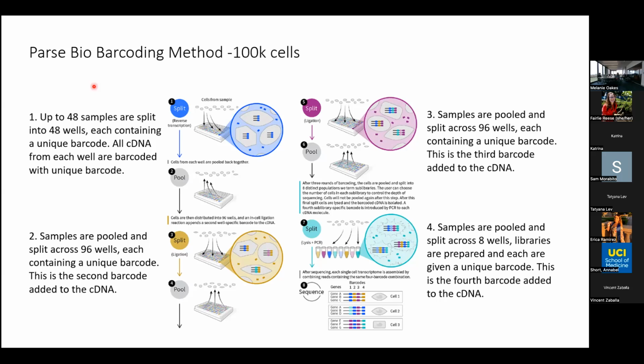I think it's like $240 something maybe for 8 samples. The beauty of that is that if you can imagine starting with 48 samples, there's no way that somebody's going to come to me with 48 samples for 10X. You just can't have them all viable. You can't have them all counted well. It's going to take you too much time to prepare to bring them to me.